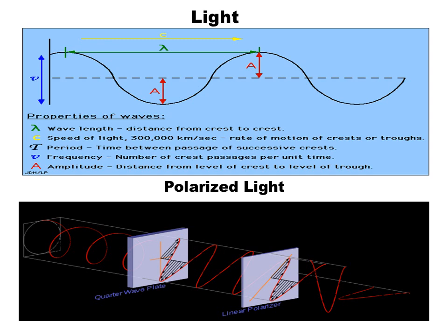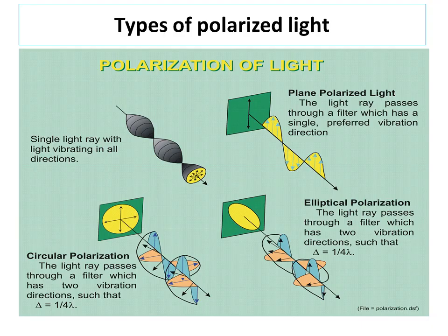Like before, we talked about light and light sources, and we've already talked about wavelength, speed of light, the frequency and the amplitude. But really, when we're looking at light here, we're looking at polarized light. Again, it's the use of a polarizer that splits the light source into polarized light, and the different types of polarization.